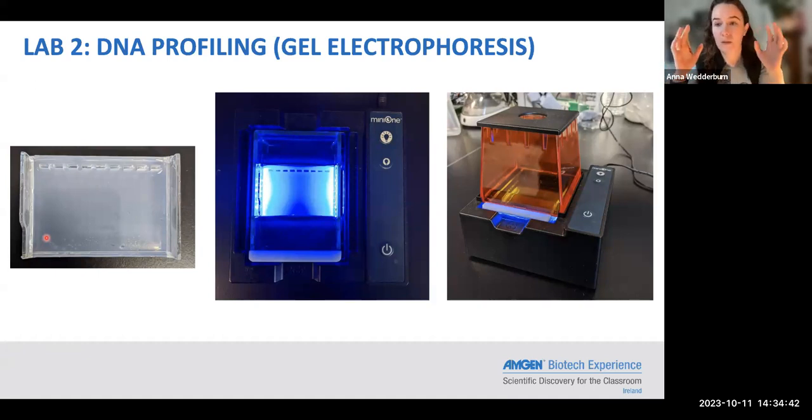So make sure the liquid actually gets into those wells. And then a top tip is to make sure that you actually put the light on when all that's in, so that it makes seeing the wells so much easier for your students, so that they can then pipette in the various samples. Again, I use my 2 elbows and kind of guide in for this one. And it's really important to change the pipette tips between each one, because otherwise they'll all get contaminated.